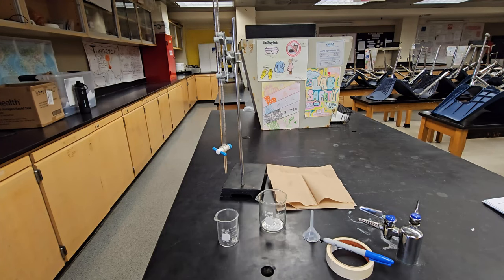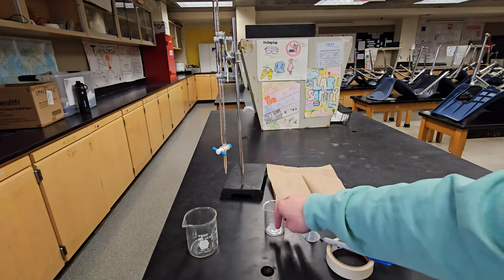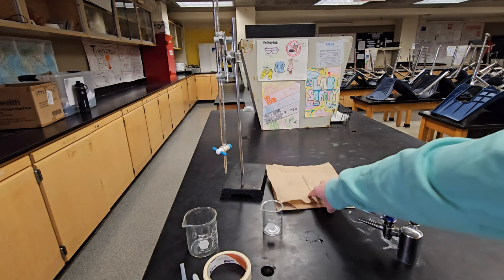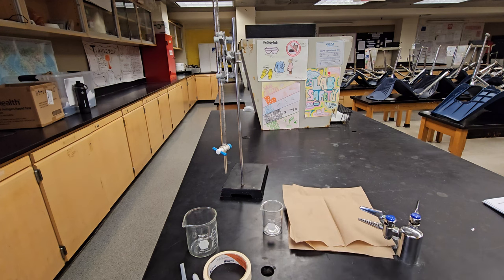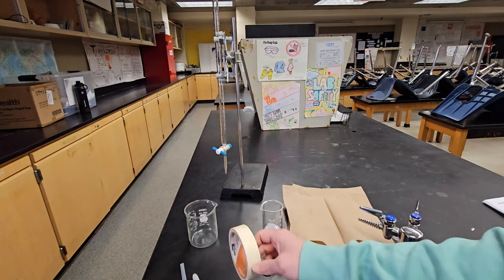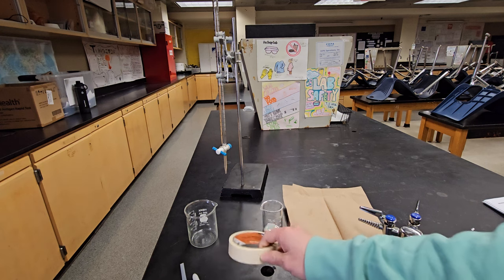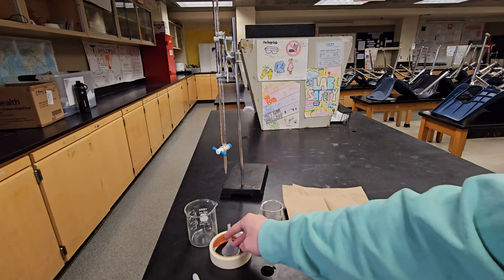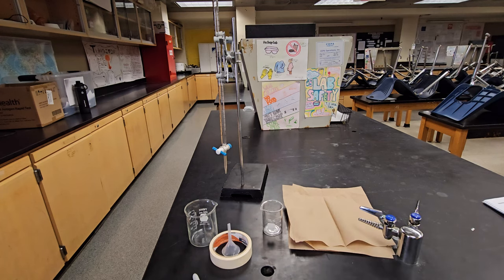Today we're going to be talking about how to perform the titration leak test. Before you get started, you need to gather two materials on your own. The first is a small beaker, which you'll be using for water. The second is a stack of five to seven paper towels, which you'll need during the leak test and for cleanup. At your station, you should already have a waste beaker — label it 'waste' using masking tape from your instructor. There should also be a mini funnel and your titration setup.